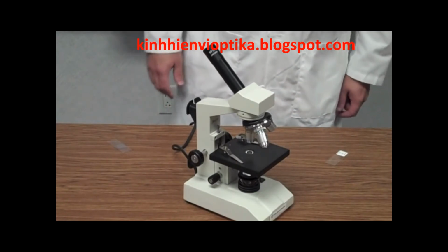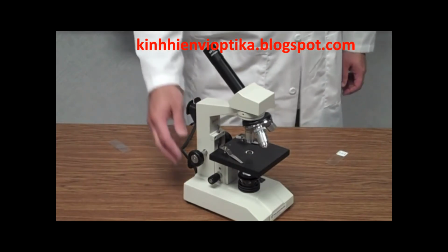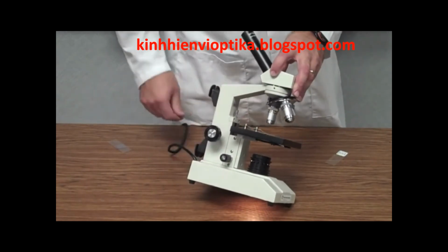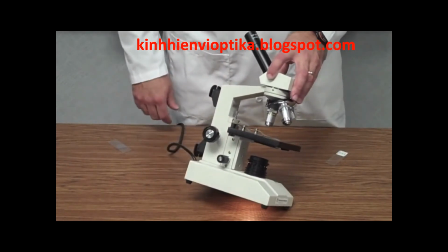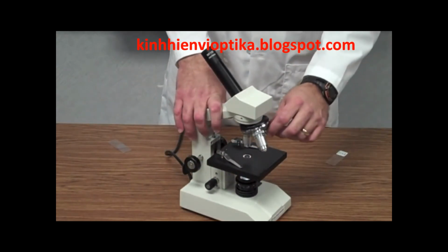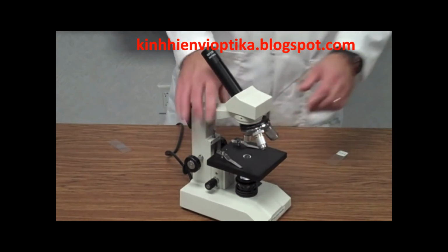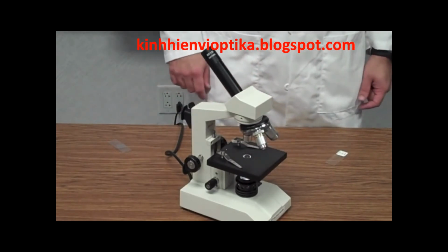The first thing is to always make sure that we have the stage as low as it can go. We use the coarse adjustment knob to move the stage all the way down. Okay? And you don't have to crank and crank and crank on it. You know, when it stops, it's done. Okay? So we move the stage all the way down. Okay? We're going to put the microscope on low power, which is the red band, okay, objective. And that objective should be pointing directly straight down over this hole that's in the stage.